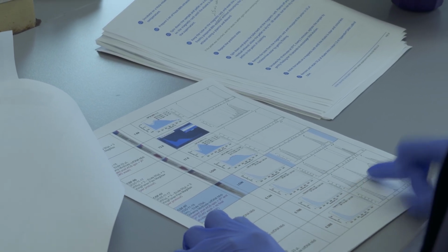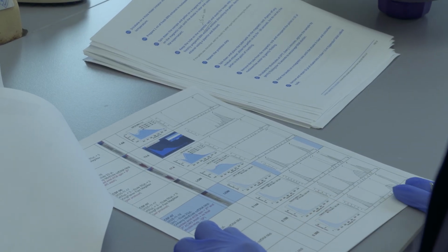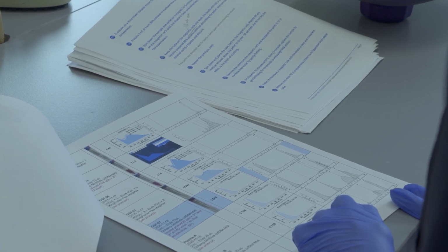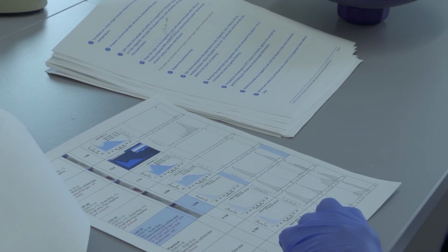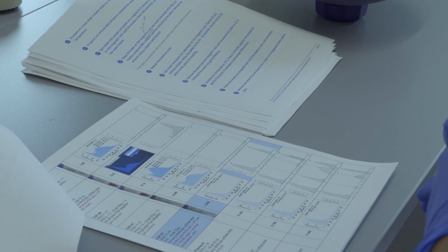Sometimes, and I don't know if you have noticed it on TapeStation, it also depends on the loading. Have you noticed that between different samples the marker gets shifted or is not calibrated properly? Yeah, this is always my experience with TapeStation.